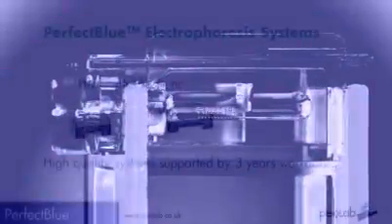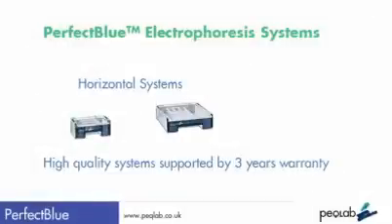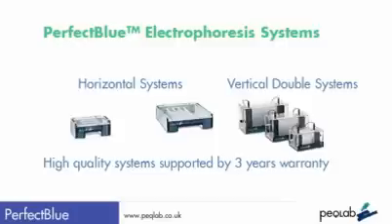One of the UK's most popular ranges, the Perfect Blue range of electrophoresis systems offers exceedingly high quality horizontal and vertical electrophoresis tanks and accessories. Each system comes with a confident three-year warranty and is packed with sensible, well-considered features which ultimately gives the researcher the best quality sample separation and longest product life.